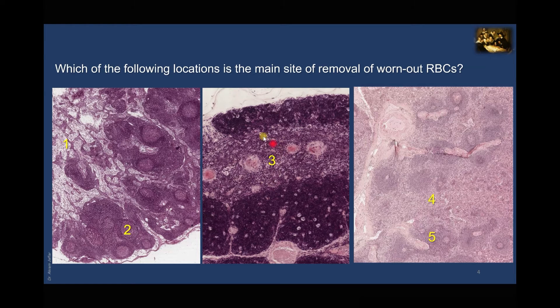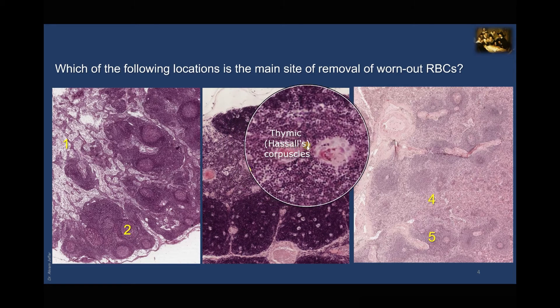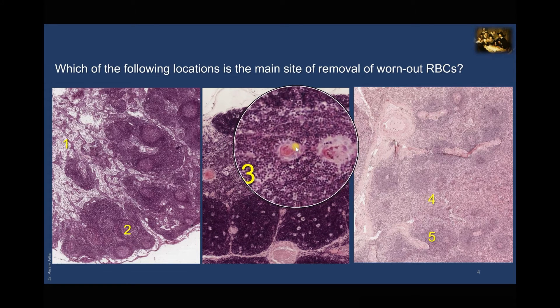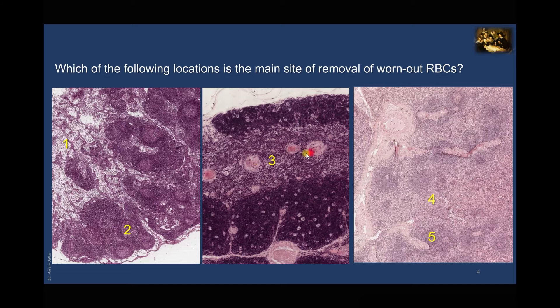The middle slide shows another encapsulated lymphoid organ with a darkly staining packed cortex and a lighter-staining medulla. The medulla shows a particular feature of the thymus: thymic Hassall's corpuscles, which are concentrically laminated structures. These laminated corpuscles represent masses of degenerating epithelial cells that incorporate macrophages containing debris from degenerate cortical lymphocytes. This confirms that area three belongs to the thymus and is not related to the removal of worn-out RBCs.